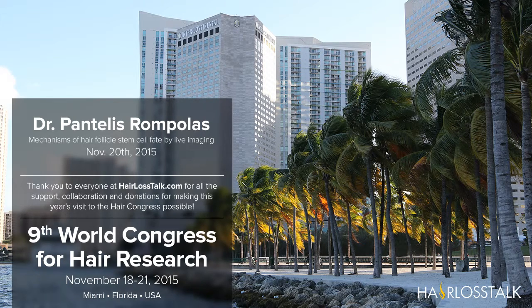So at this stage, the matrix has collapsed. There's no more proliferation taking place. But during the catagen process, we can still trace the inner lineages and the hair shaft continuing to move upwards and out from the skin. And in these frames from a movie, you can see the traction between the cells in the outer root sheath and the cells in the inner and hair shaft, and the changing relative position as the inner lineages continue to be excluded from the skin and the outer root sheath remains at a constant plane.